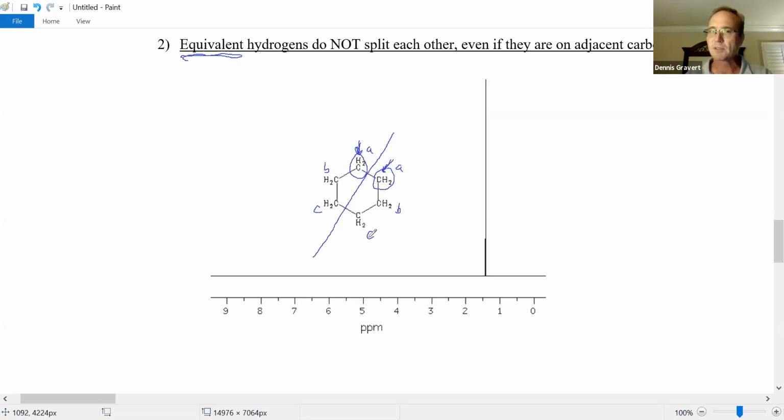Aren't there three types? And so I'll say nope, because there's another plane of symmetry here, meaning that now across this line, A is equivalent to B. So let's not call it B, let's call it A now. And then B is equivalent to C. Well, no, let's call it B now, because they're the same. What else? We got A equivalent to C. Well, no, that's not C, that's A now.